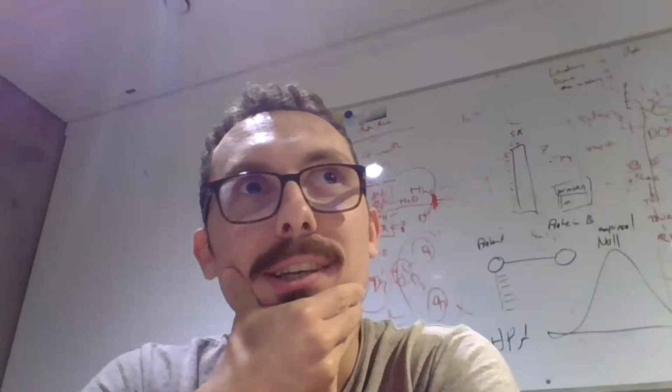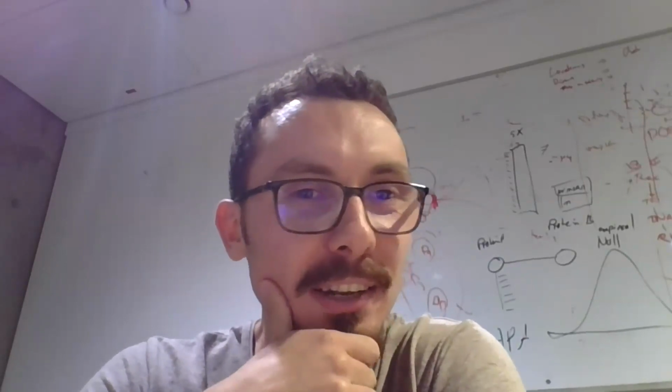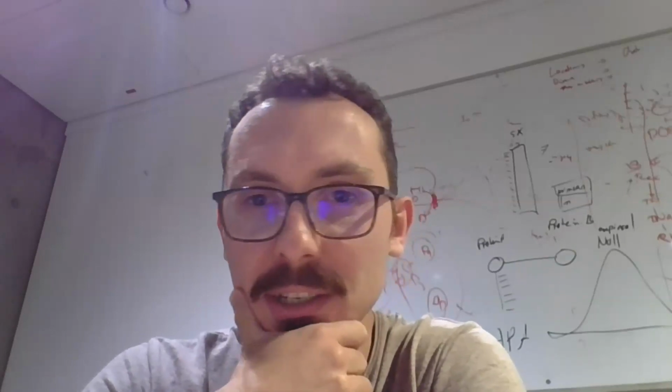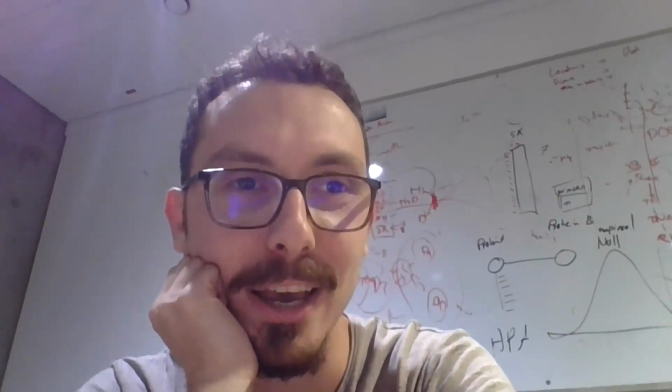I think Konstantin will be better suited to reply, but what I've seen is that this is an effect of the log-fold change shrinkage. Basically, log-fold changes get shifted close to zero. But I don't know what else to say about that. Interesting. Maybe if I can chime in there. I would have expected that these lines in the volcano plot, which I have also seen, are just because you have a discrete number of non-zero values. So all are zero but one, then depending on the estimated variance, I guess you can have these kinds of effects. But I don't quite remember. I think I once looked into this, but Pau maybe.